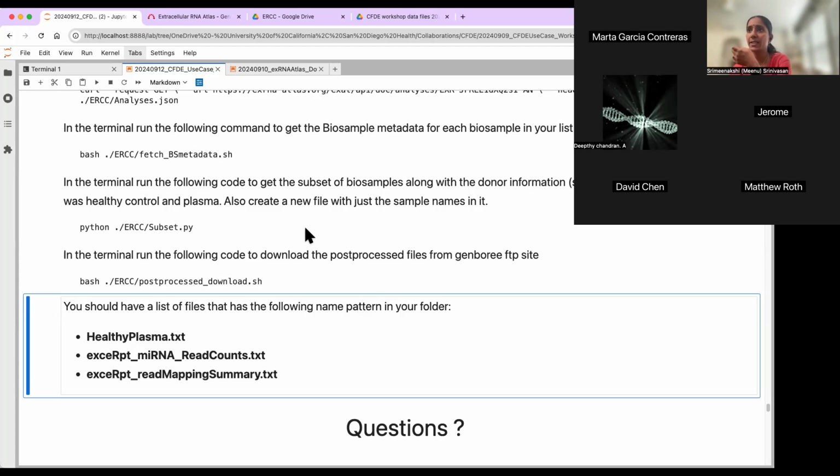Should we apply batch correction? For the DEC portion, are you asking, Han Kim? Yes. I guess it depends on how the data looks. Originally, when I ran this, I ran it on all the heart tissues together. There were atrial tissues as well as ventricular samples, and at that time I had trouble with how the data looked on my PCA. So I ended up doing a batch correction for the organ at that point. Depending on what it looks like, you would download the data, do a PCA analysis, and see how it looks.